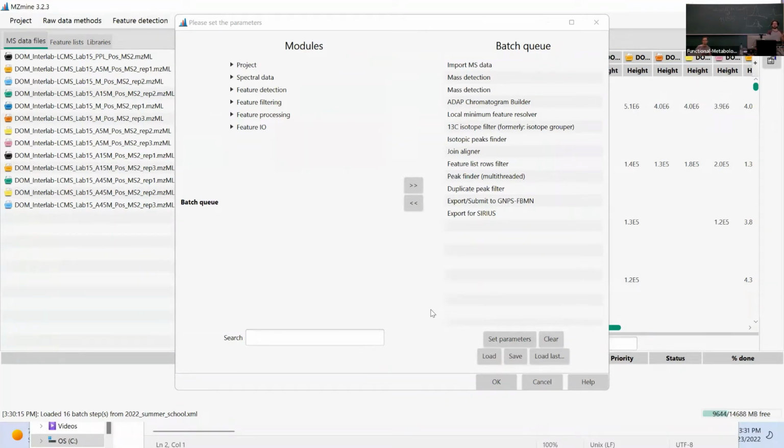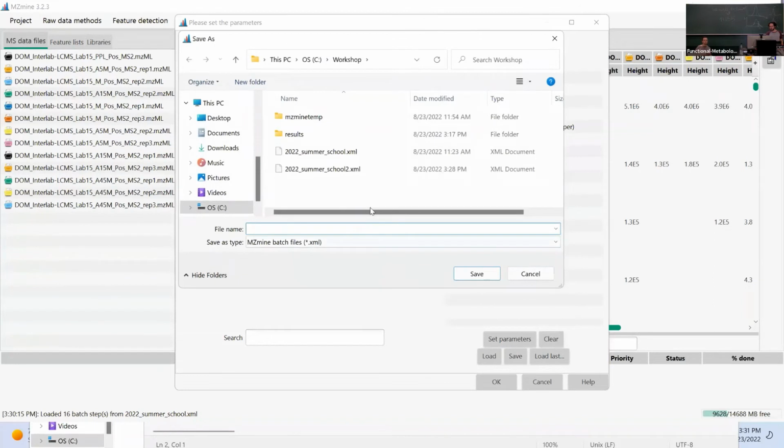And it's interesting to just compare. Is it the same instrument really? So yeah, if you have any doubts there, don't hesitate to ask. Right? So I think this is really important.